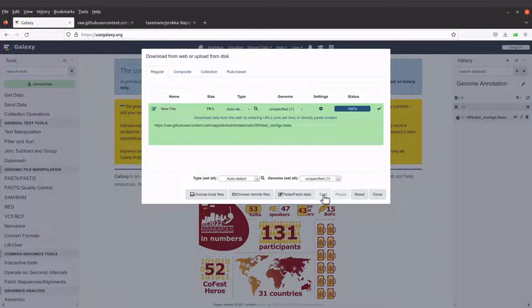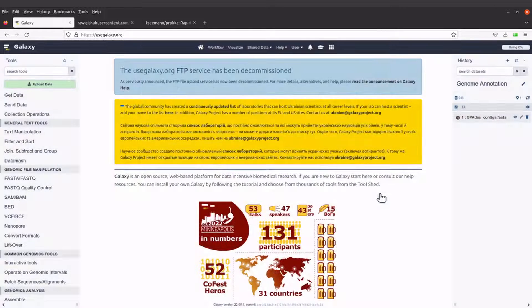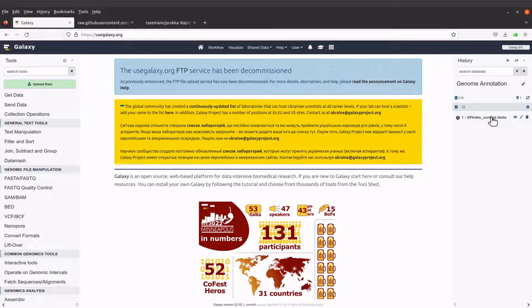It now says 100%, so we can close this window. Come to the right side and you will see the progress — let's wait for the data to be fetched.